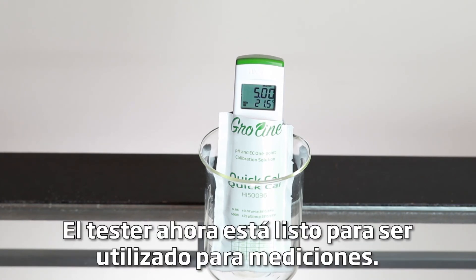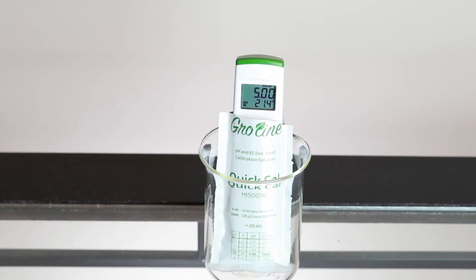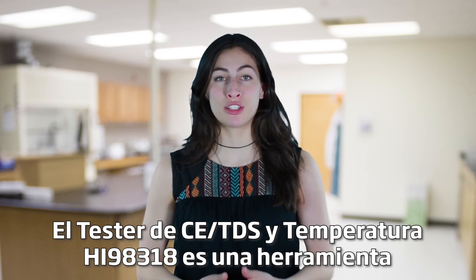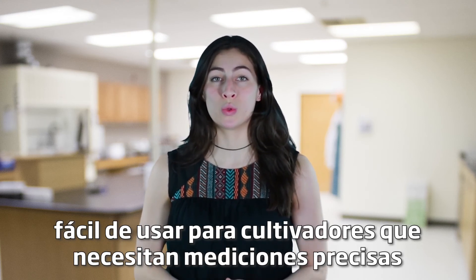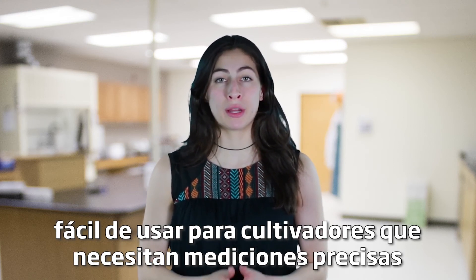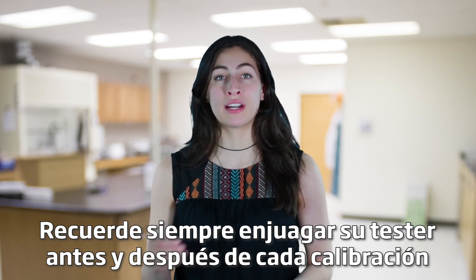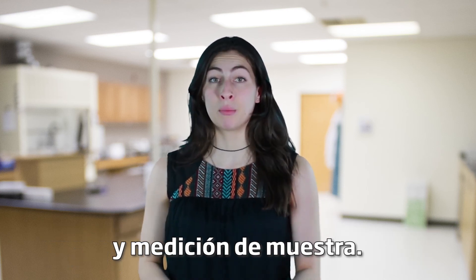The tester is now ready to be used for measurements. The HI-98318 EC-TDS and Temperature Tester is a simple-to-use tool for growers who need accurate measurements of EC and TDS in their nutrient solutions. Remember to always rinse your tester before and after calibration and sample measurement.